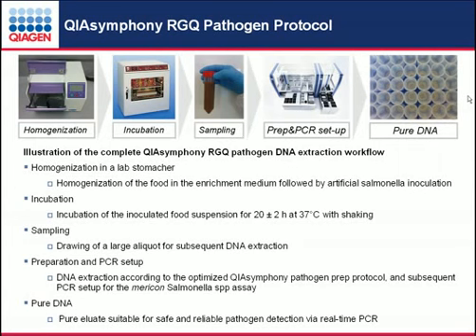And then if you have the assay setup module as well, it will set up the PCR for you, allowing you to have completely hands-off purification and assay setup in one instrument. And then you put it into your PCR cycler, and you get the CT. So it's very, very simple, and it allows you very nicely to have an automated system.